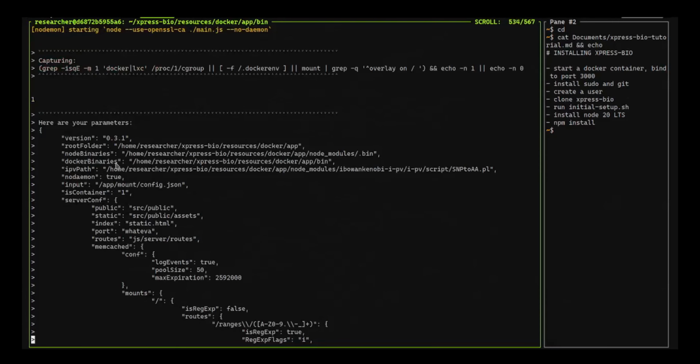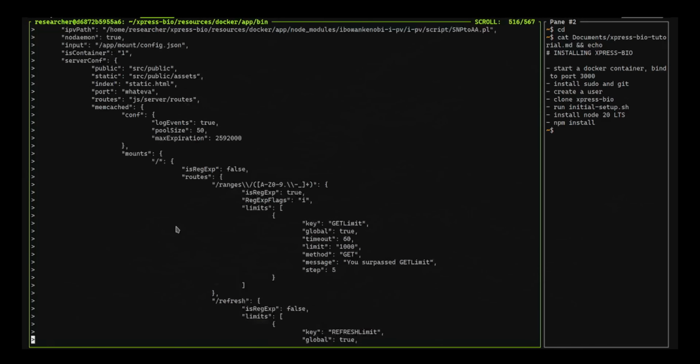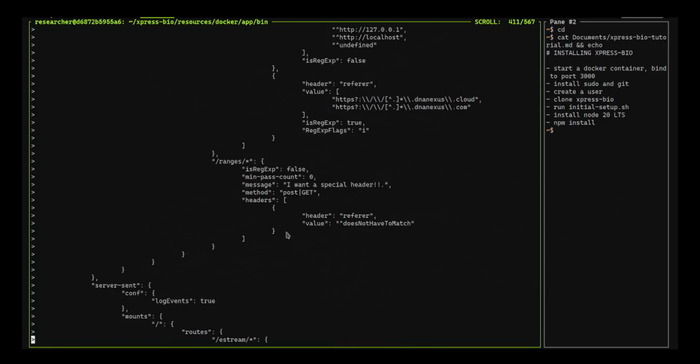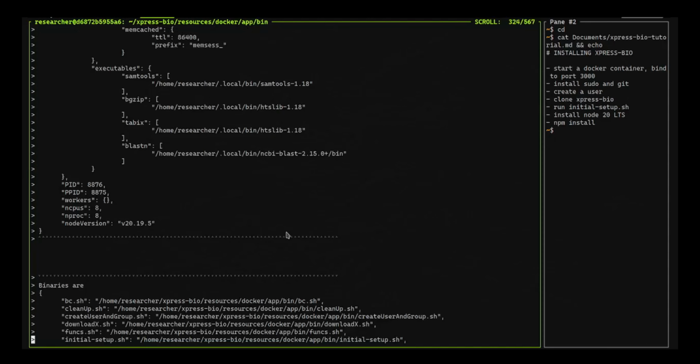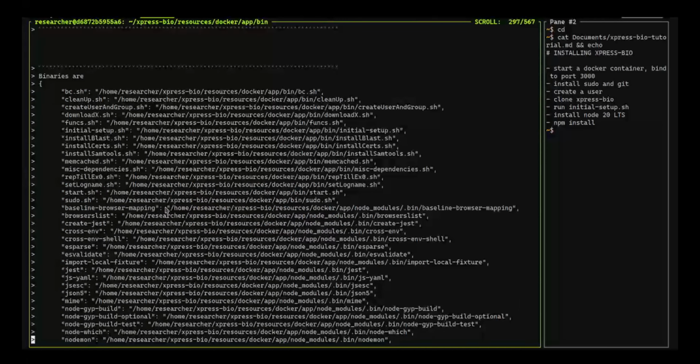And here, your final configuration file. And then this is the deep merged final configuration. So it means, for example, in the server.config.json, there's nothing like this, but they come from the initial setup.config.json. So you have extra other information, mode, version, whatnot.